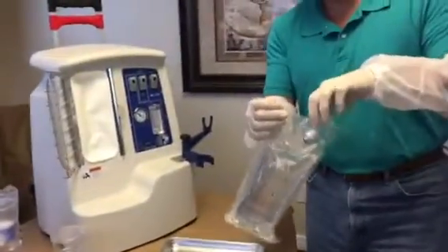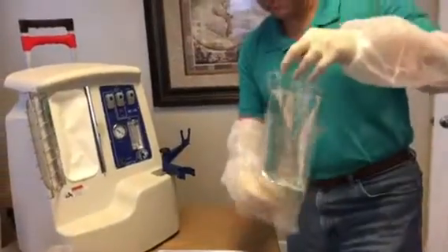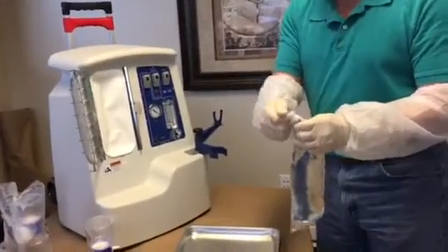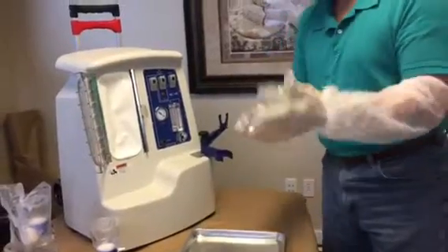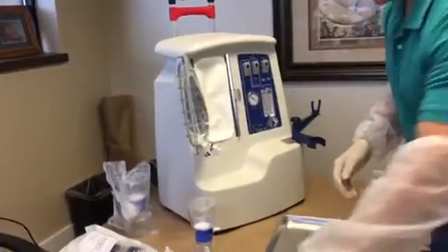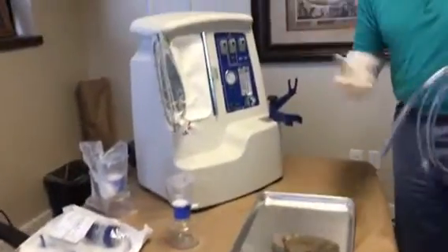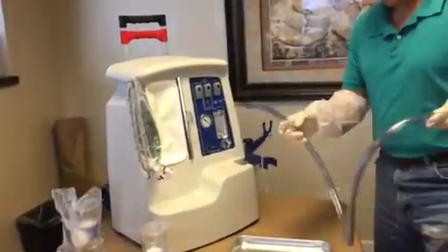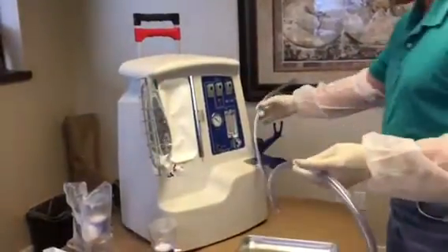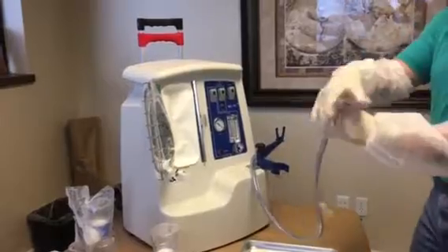So you just open this up, pull the solution bag out, break off this little cap, hang this bag. Then I'm going to take the extension tubing — and by the way, the reason I'm not wearing a mask is so you can actually hear me — take this extension tubing, open it up out of the over-wrapping, and hang that there.